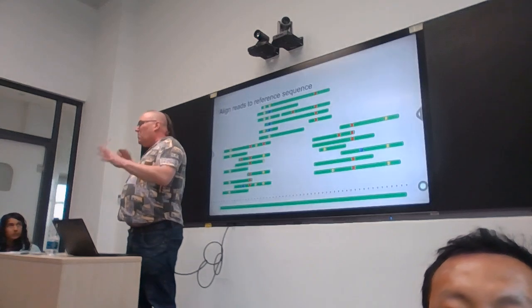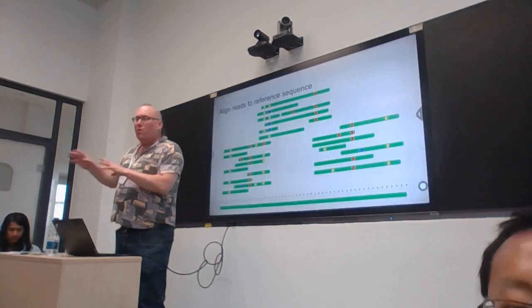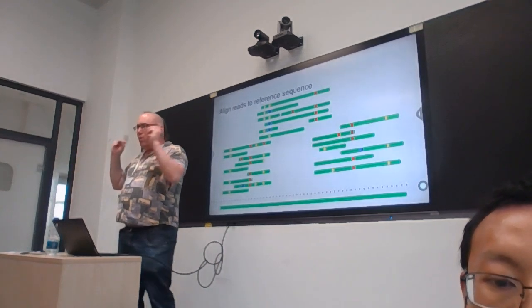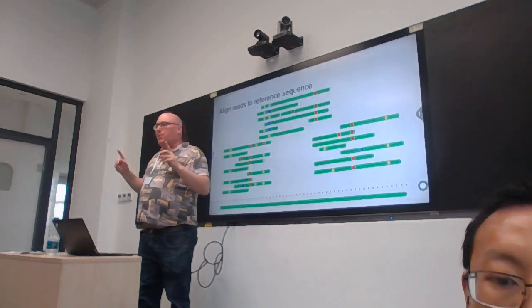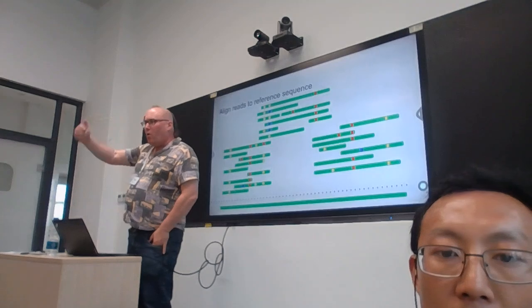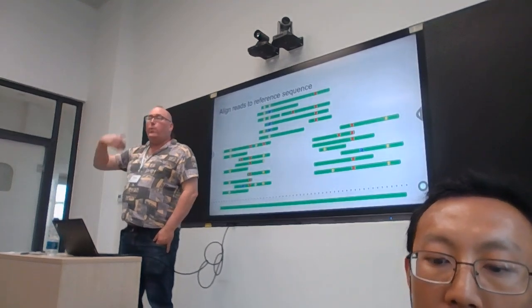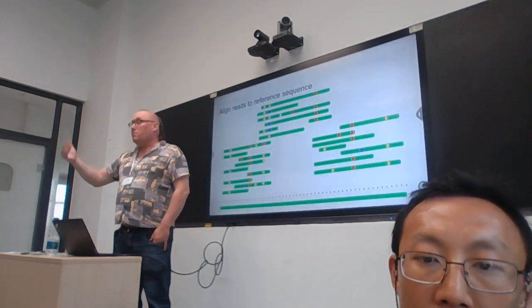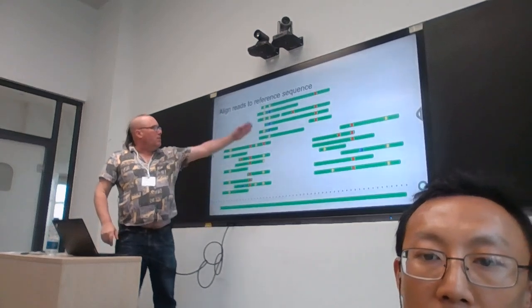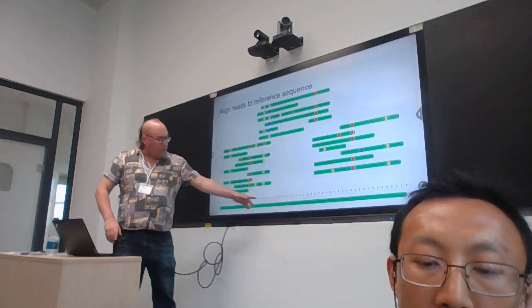But that's why I said to Sophonius, it's difficult to do this teaching because the whole world is changing. People are designing new primers, they're using new references. So that's why I'm emphasizing this, because I want you to be very aware of these things. I know you mostly are coming from a lab background, and when you're doing this analysis, you must know when we change the reference, what does it mean? When we change the primers, what does it mean? And then the colorful things here are your inferred differences to reference, right?